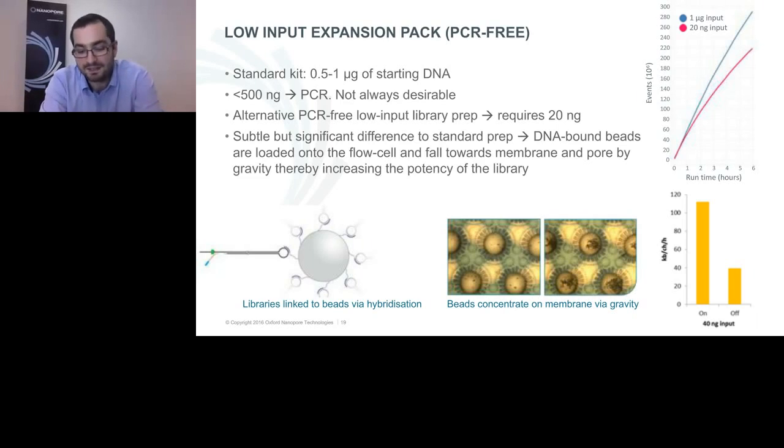Well, the advantages of using nanopore sequencing are that it's single molecule, it's PCR-free, and it's long read. The advantages that you'd have over sequencing, I don't know if it's necessarily limited to bacterial, but the assembly is easier with the longer reads because it's PCR-free. You can see any epigenetic tags that you might be interested in that might be lost in PCR.